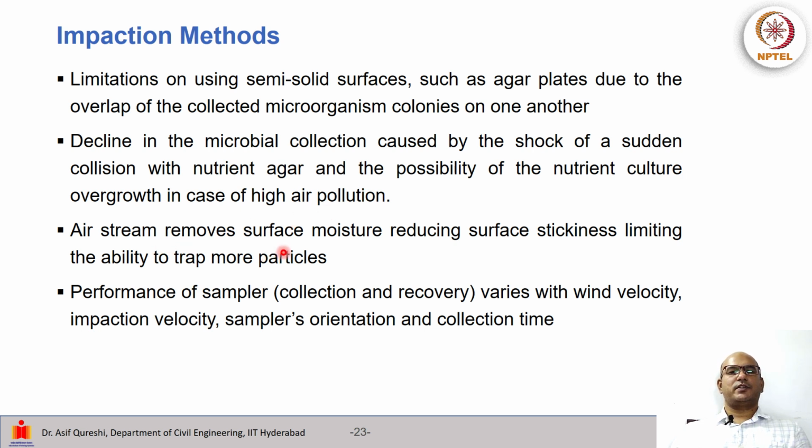Now the airstream also removes surface moisture, that means the surface stickiness may be reduced, and hence the ability to trap particles may also be somewhat reduced. The performance of the sampler, which includes collection and recovery, also varies with wind velocity. So we may need to maintain some optimum regime on the impaction velocity, the sampler's orientation, and the collection time also.